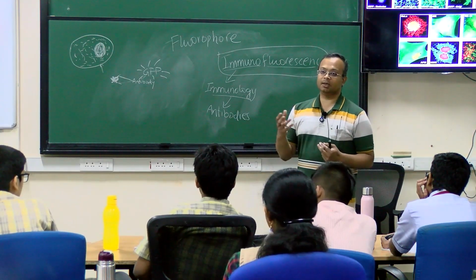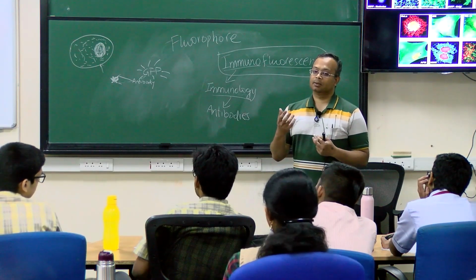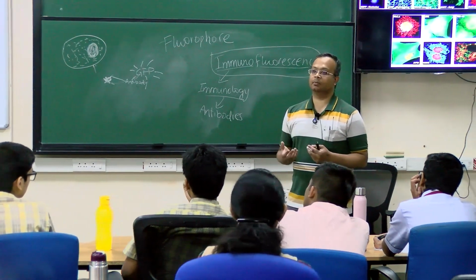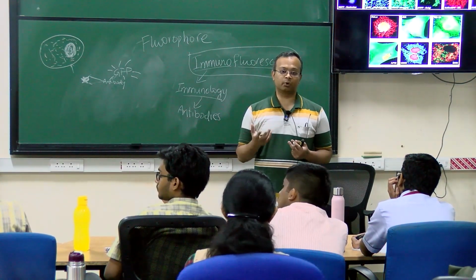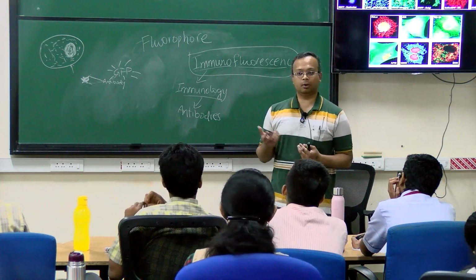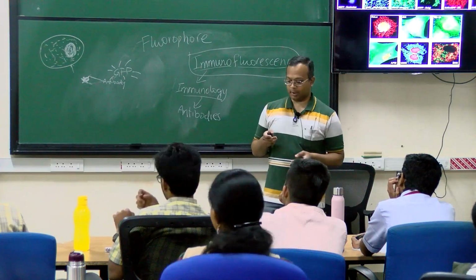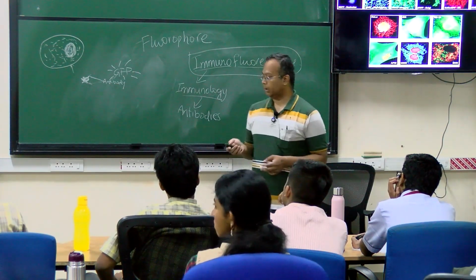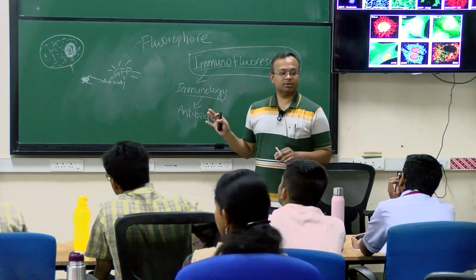So using this kind of information, you can identify what is the state of the cell, whether it's a healthy cell, whether it is behaving abnormally, whether it is producing its proteins properly, whether it is doing its metabolism properly. All of these things you can identify directly by looking through your eye. Okay. Okay. So any questions up till this point?